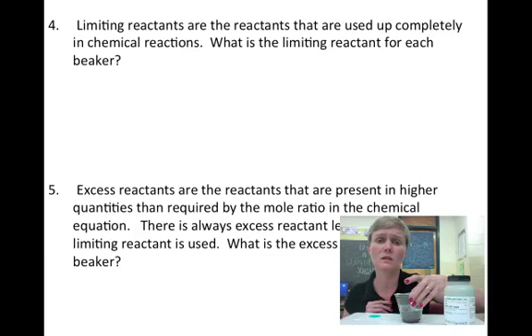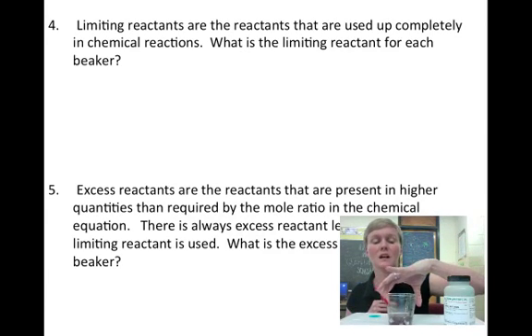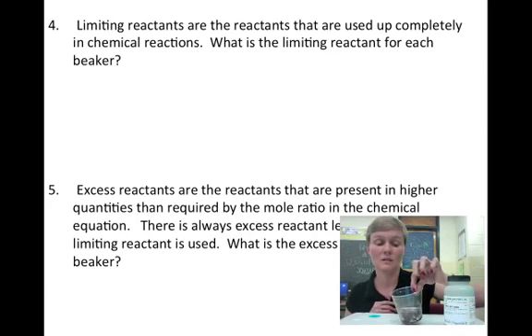For number 2, there's no aluminum, but there's also no copper chloride. There's no blue and there's no aluminum foil. So I don't know what to say. Looks like there are 2 limiting reactants. Go back to the third one, and the copper chloride's all used up. So the copper chloride's your limiting reactant, and we have aluminum left over.